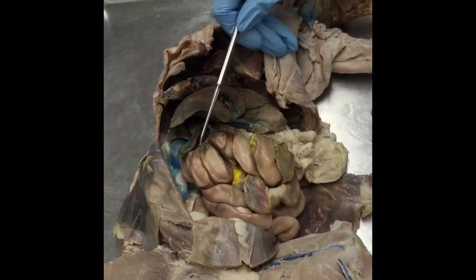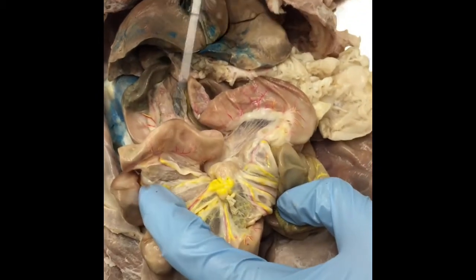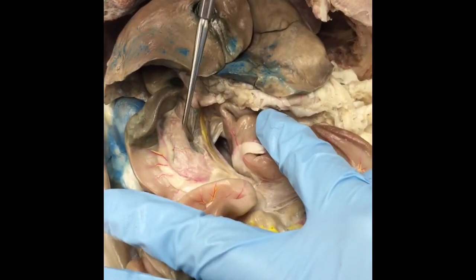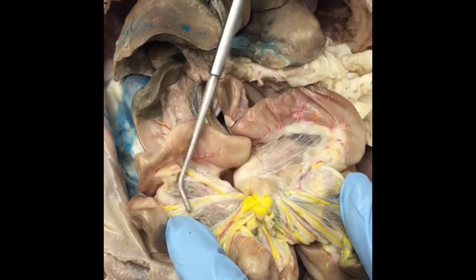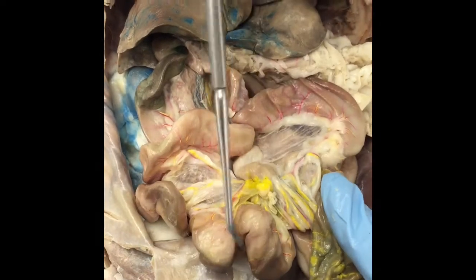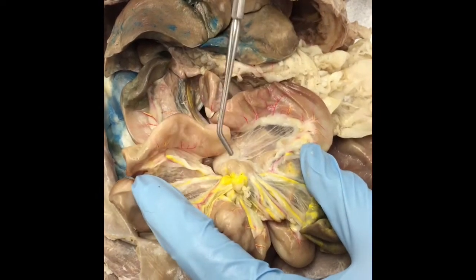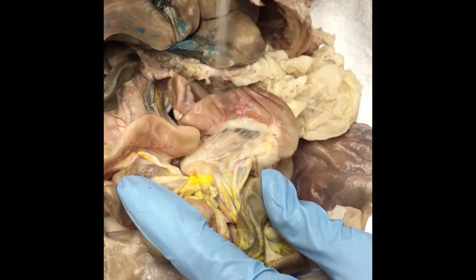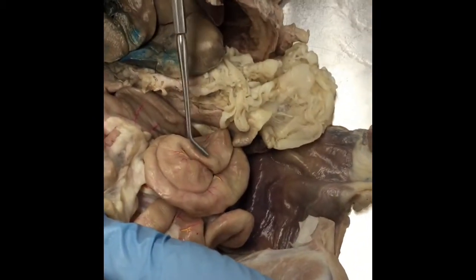Okay. This is all the small intestines, and then reflected. We have the duodenum over here, and then the mesoduodenum, and then this is all mesentery, all this yellow. And then we have the jejunum, which are all these folds, and then we have the mesentery lymph nodes, which are these 2 things right here, and then we have the cecum, part of the large intestine, and then if you flip it over, we have the ileum right here.